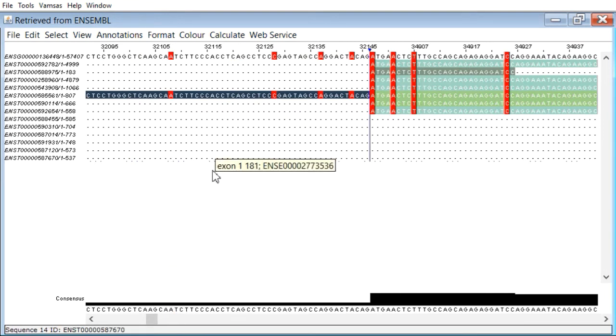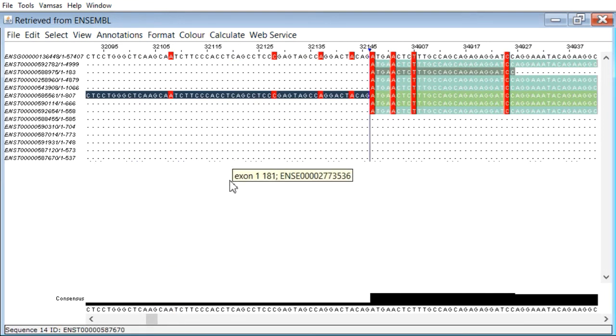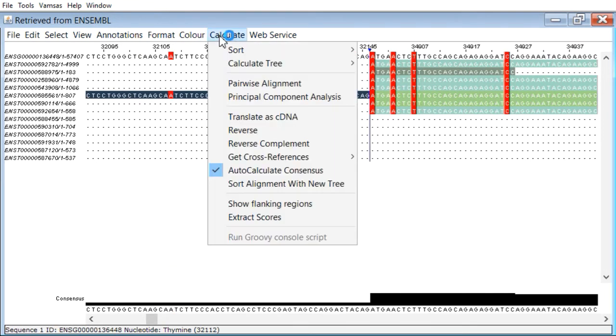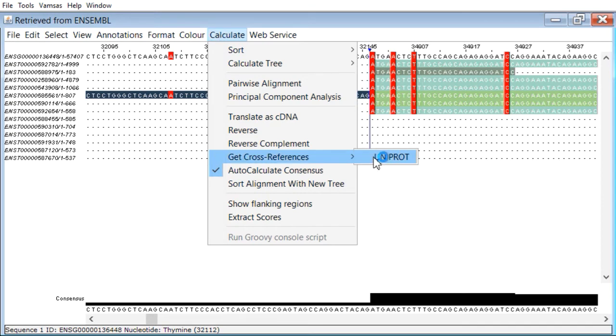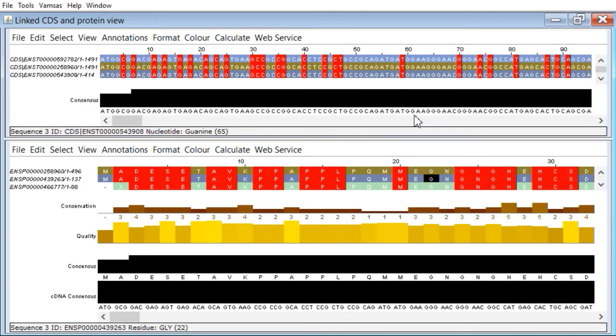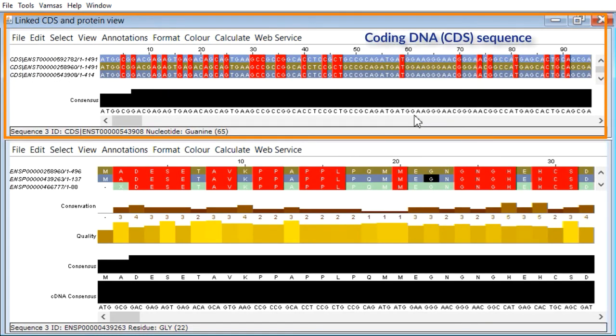Now what we're going to do is to map this through to the protein. Going to Calculate, Get Cross References, and it's going to cross reference through to UniProt here. So we'll click UniProt. Up comes a two-pane window.